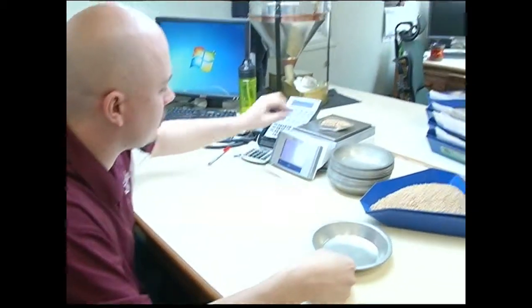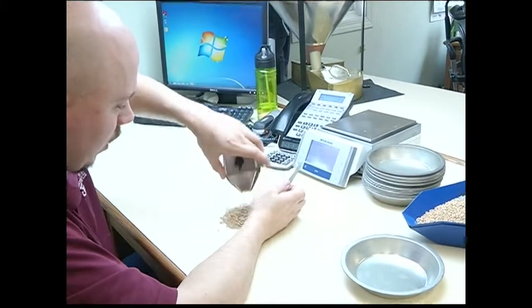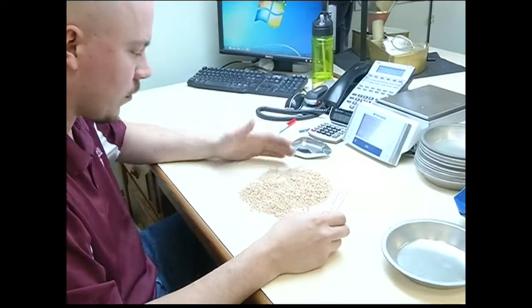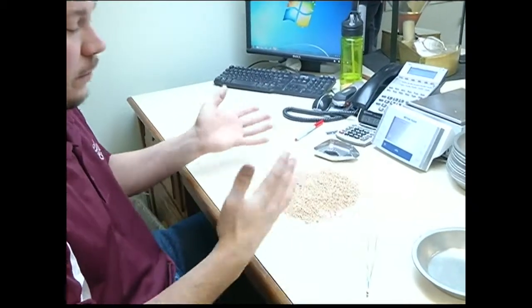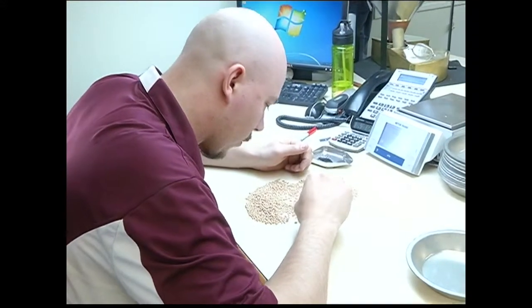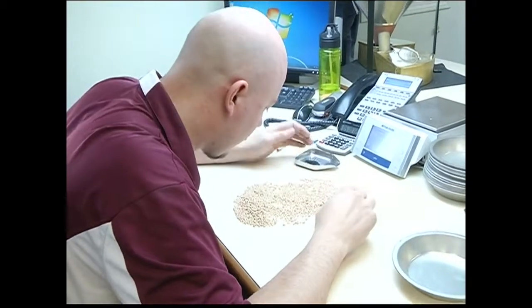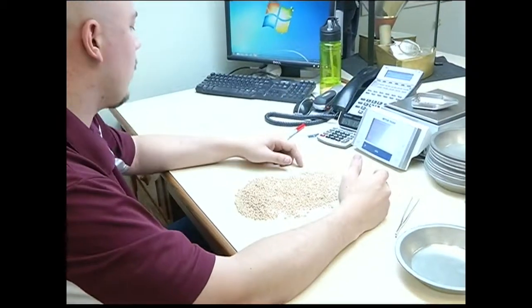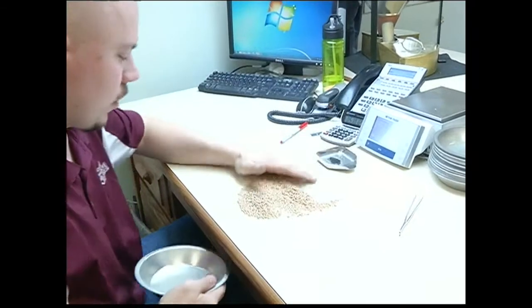All right. This is also what Jeff broke down at the sieve. This is a 60 gram portion. I'm going through this for foreign material, like barley, rye. Since this is a wheat sample, that's considered foreign material. It shouldn't be in the wheat sample because they use barley for different stuff like beer. Weed seed is also stuff that can get into there. We'll pull that out. If it weighs up, then we mark it on the foreign material line. If it doesn't, then we don't have to put anything.